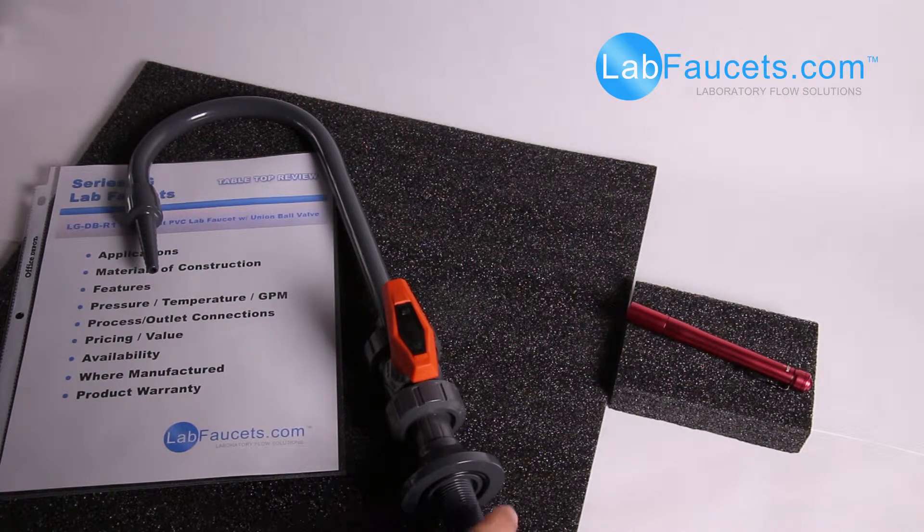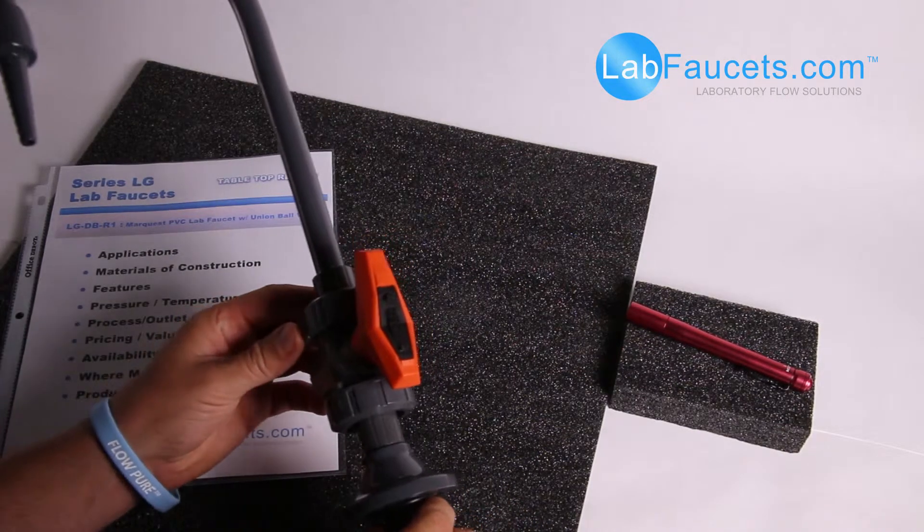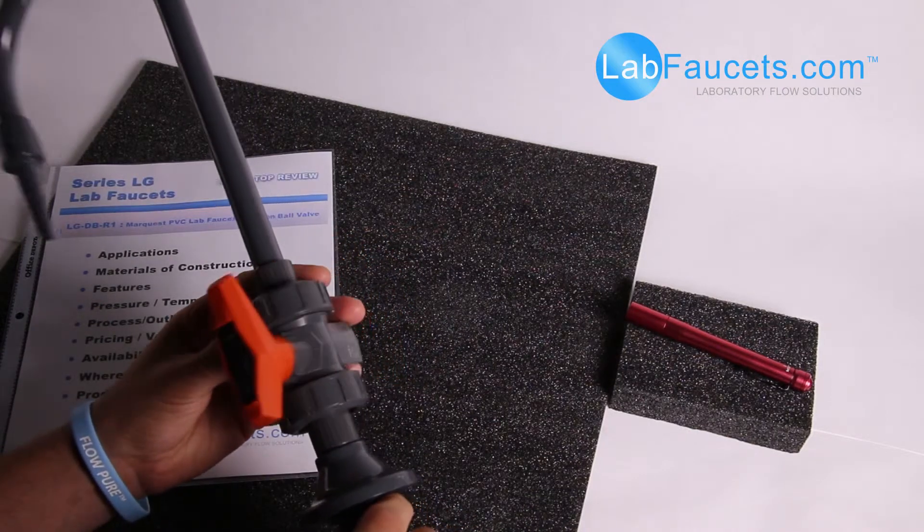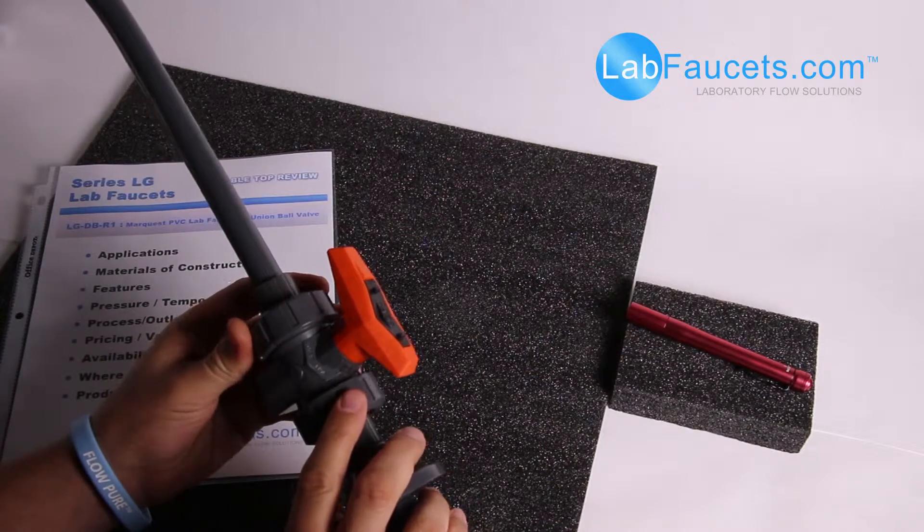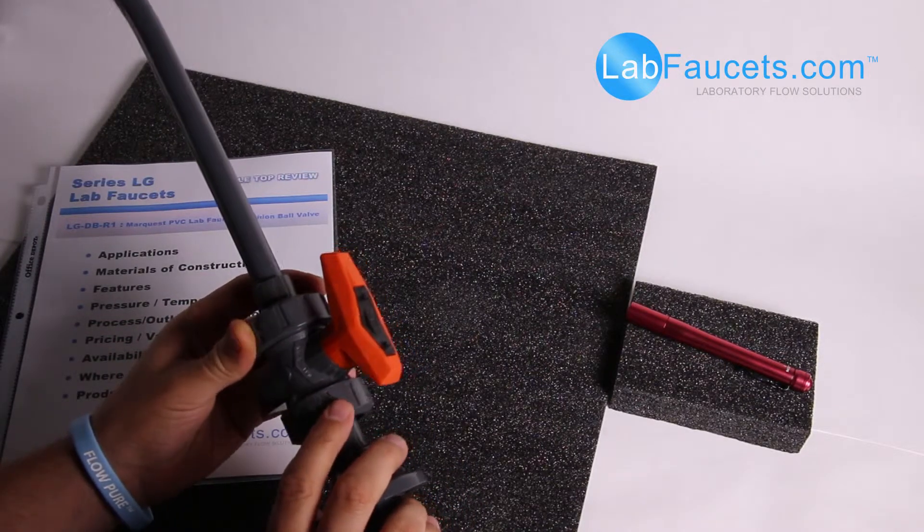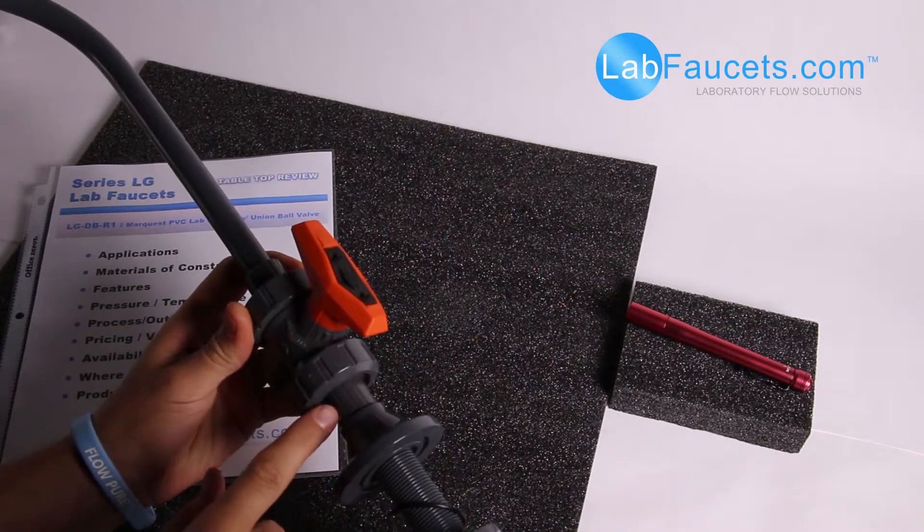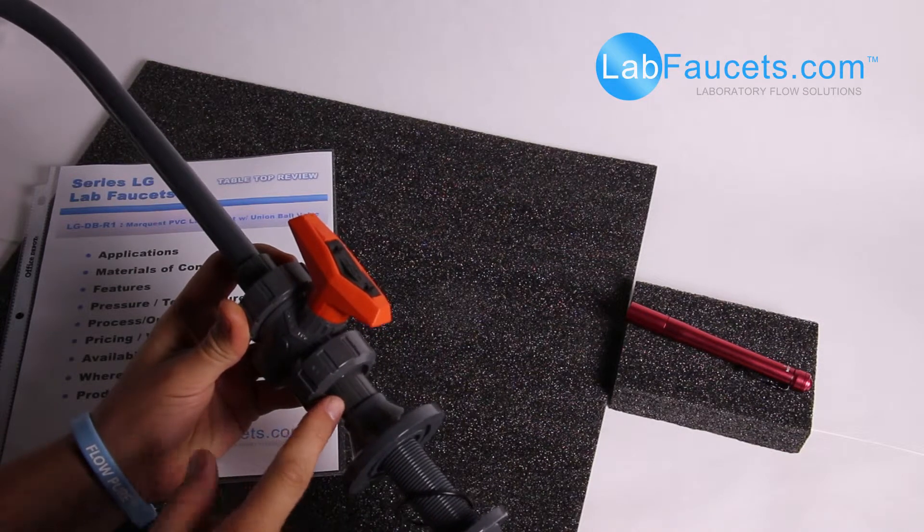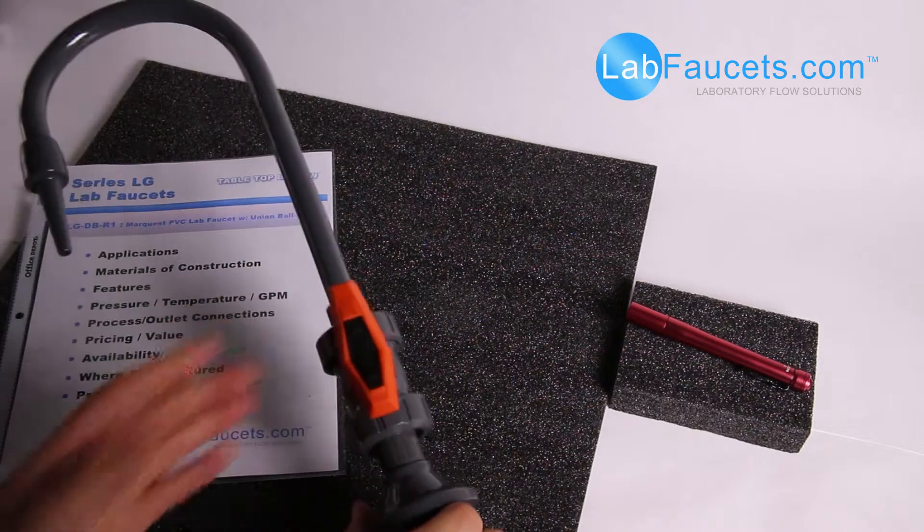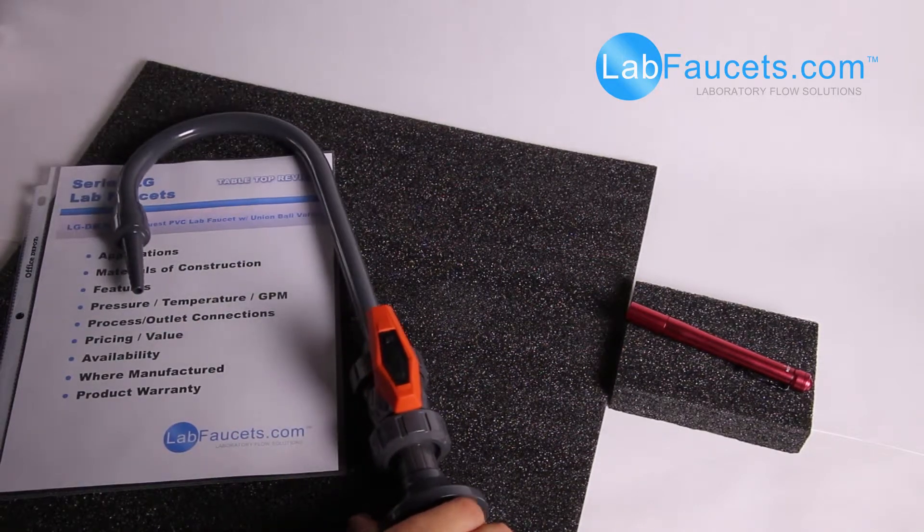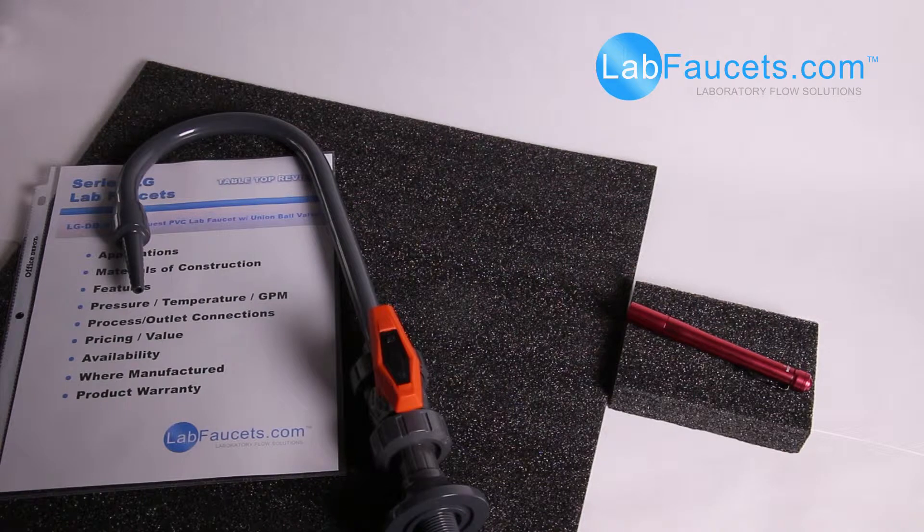The Viton is basically just the O-rings that are inside this true union PVC ball valve that seal the adapter to the ball valve body. These units are also available in natural polypropylene and PVDF.